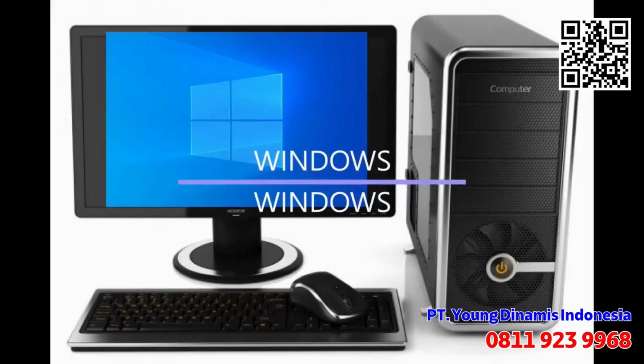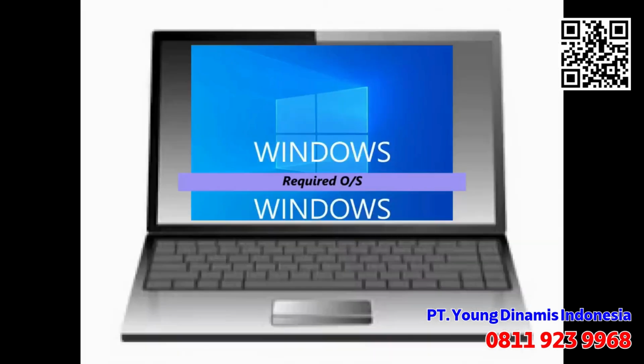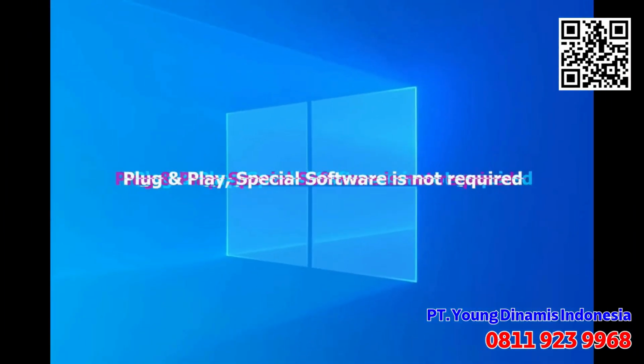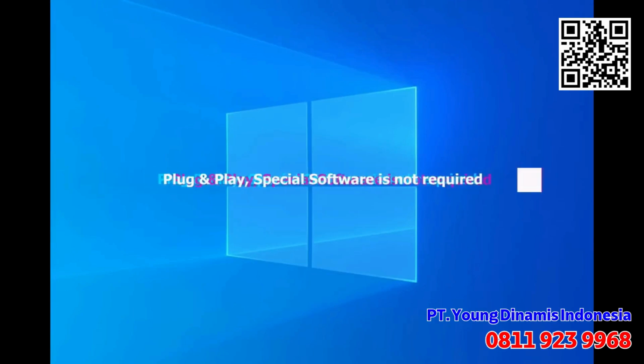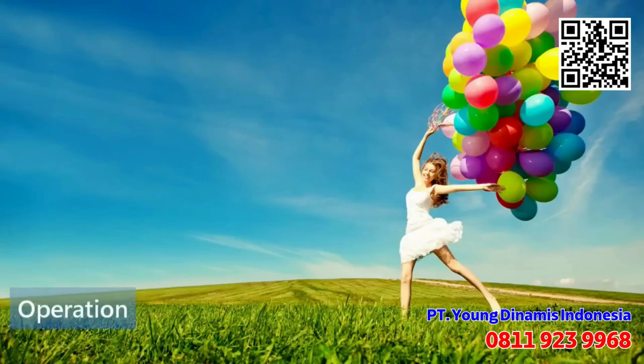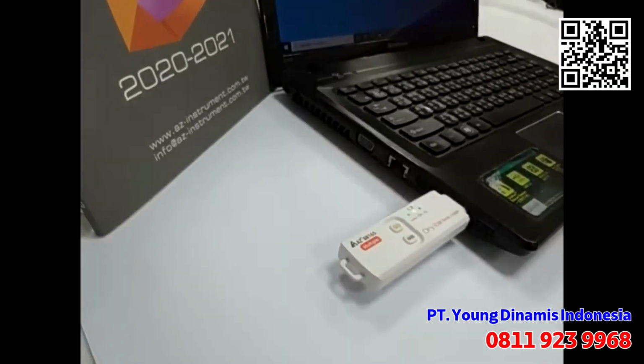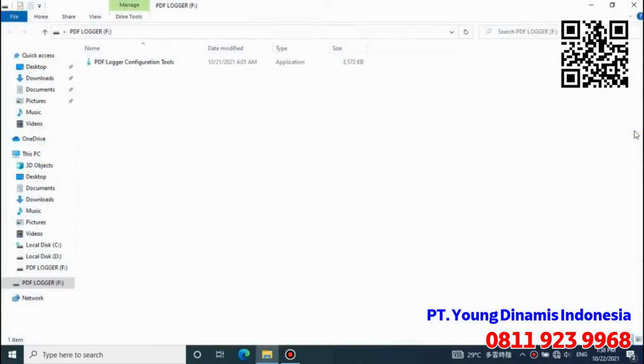A computer or laptop for logging configuration. No need to download or install any driver and application to computer. Plug the logger into the USB port of computer. The green LED will be turned on while logger is connected. The logger is recognized as a CD-ROM.